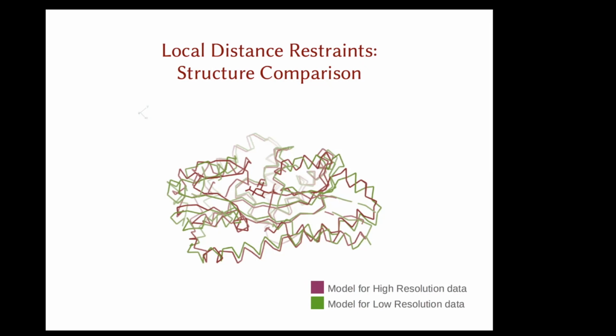And we can ask that for every atom. That gives us a set of local reference distances. And then the idea is to apply those reference distances to our current model. But because they're local, they allow large-scale motions while encouraging local environment changes to be minimized.